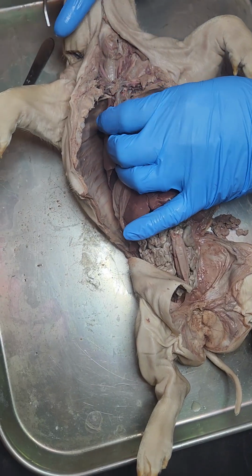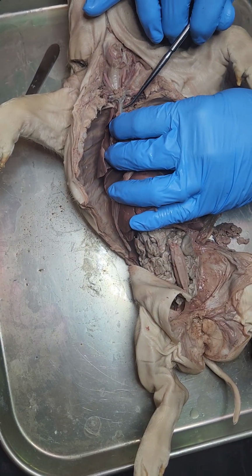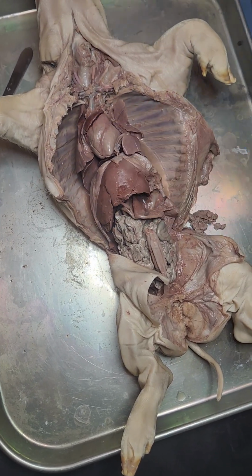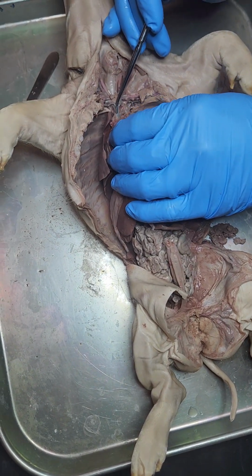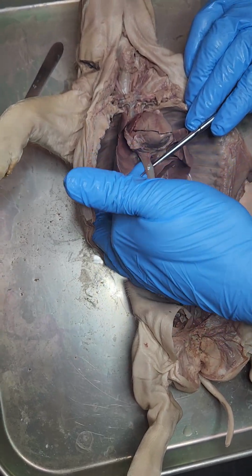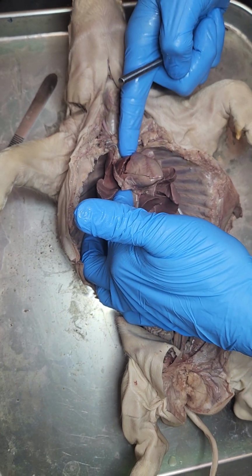Cranial vena cava. So cranial vena cava would be this right here. And this is where all the jugulars drain to. So it's going to the heart. All right, so veins run to the heart, arteries run away from the heart. All right, so cranial vena cava is here. That means caudal vena cava will be below the heart. Caudal means tail. So that's the caudal vena cava. That's the cranial vena cava. Both of them are running to the heart.